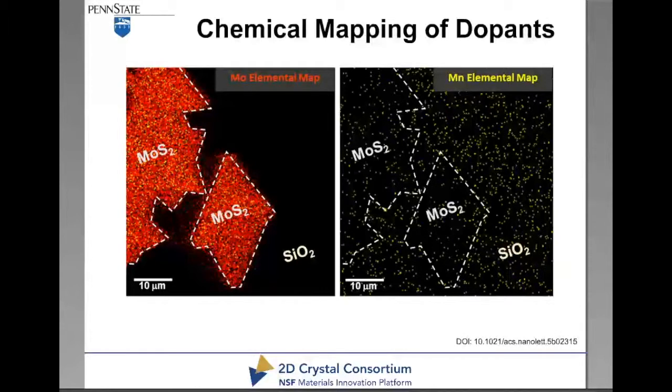The interesting thing is when you're measuring the band gap of TMDs. So this is where STM, STS comes in. Quite often when one reports a band gap of a MoS2 or a tungsten diselenide, etc., they use photoluminescence to measure that band gap. And that's not correct to use photoluminescence to measure the band gap of these TMDs. And I'll tell you in a minute. The first is, here's one example.